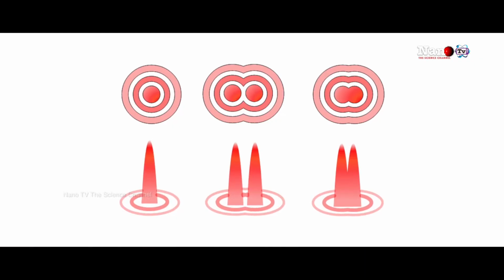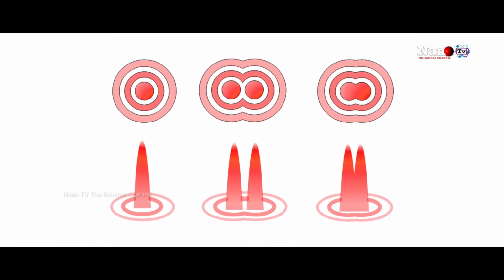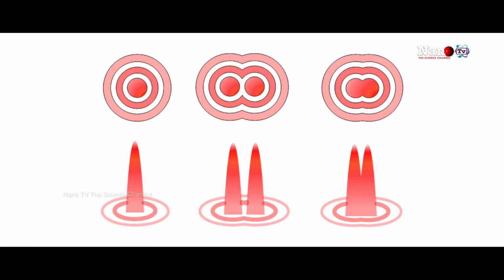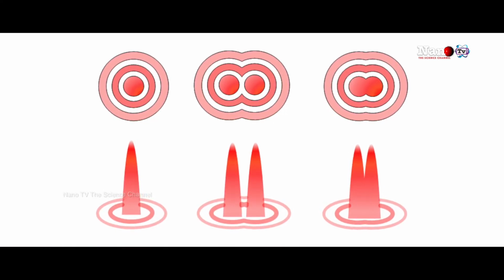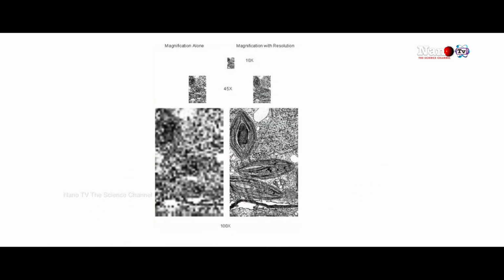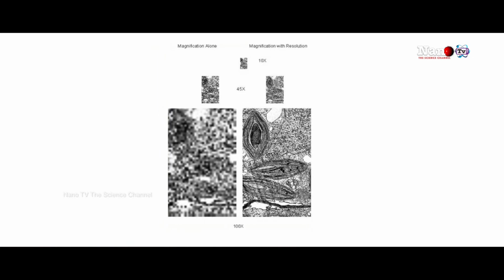The two most important things you must remember while you try to image are magnification and resolution. You can magnify by lenses, but whether resolution remains or not is the question. How to understand resolution by common sense? If you take a small hand lens and try to draw two very small dots using the lens, and then remove the lens, you will be able to see only one dot. If the two distinct objects, though very fine, are not able to be seen separately, then it is called not resolved. So magnification as well as resolution both have to be brought together to get the real image.